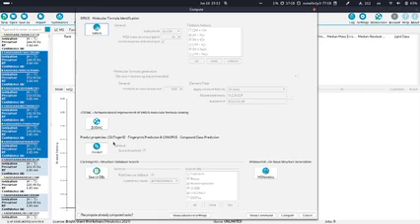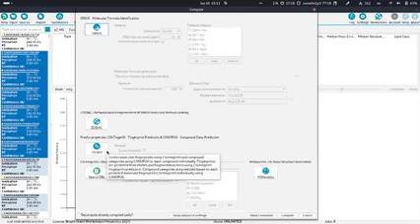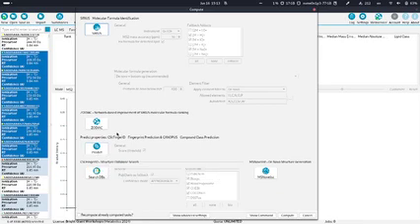Kai already showed a slide of all the tools, of all the methods which are included in SIRIUS. And now we have them here already. Also a little bit changed. For example, in SIRIUS 5, you had an extra button for CANOPUS, for the compound class prediction, which is now included in this predict properties in the middle. So most likely it will be run for the computations you do. Of course you have to enable it, but for most tasks you probably want to enable this button anyways.